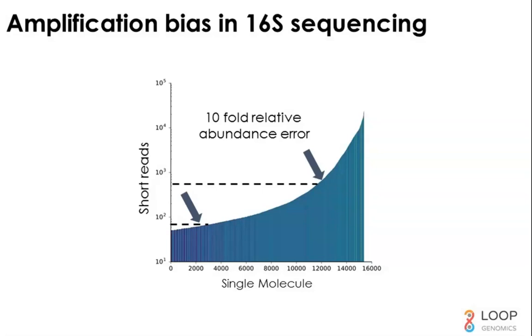We call this the PCR bias plot, and people rarely look at this because they generally just ignore biases in PCR amplification. Since our technology is UMI-based, this is part of our automated pipeline's output, and we see this for every single PCR. And this is not a particularly bad PCR plot. Every PCR plot that we look at essentially looks like this.